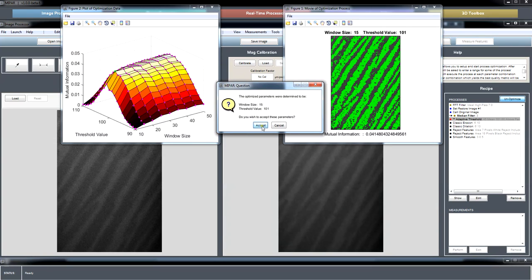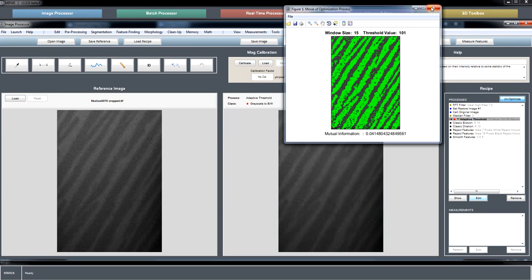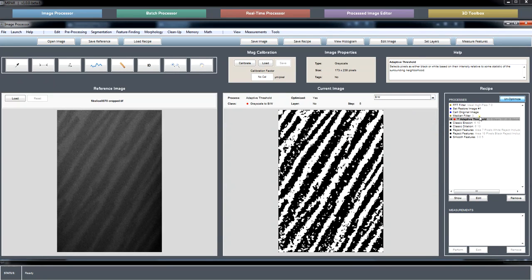It usually ends up reducing your window size relative to what you would get without it. And on average, I tend to like the optimized results better when running off of that comparison image, the FFT image. So we have our rough threshold here, black and white. Then we run a classic erosion step that gets rid of sparse noise that's usually present in the case of noisy images.